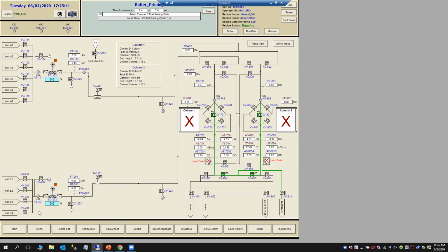We again set the loop cycle to 1. So we will expect to see valve priming. This is the second valve. The next sequence that we have in line is a column process sequence, which is a 30-second procedure, which will use our column, which is currently in line.